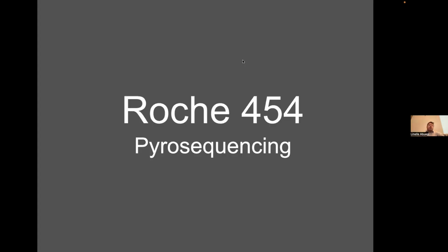All right, so the sequencing itself. I'm going to talk about some sequencing that doesn't exist anymore, but that gives you some idea about where we're coming from with the new technologies. Roche 454 pyrosequencing. Roche appeared in 2010. They have a working product, and they use this technique called pyrosequencing. Pyro is light or fire. So you sequence with light or fire.